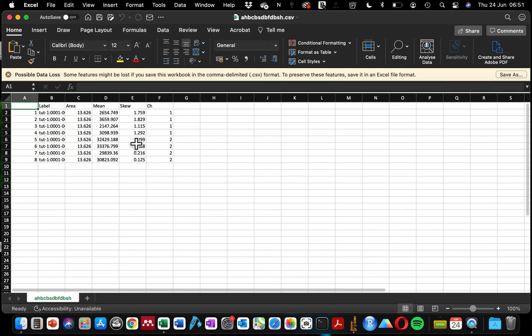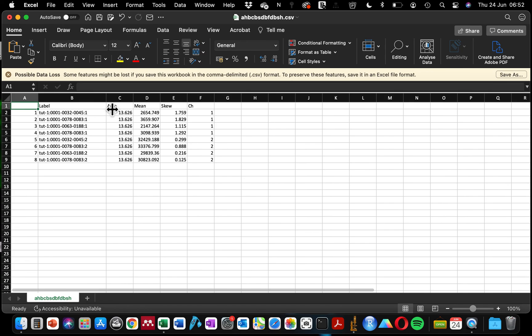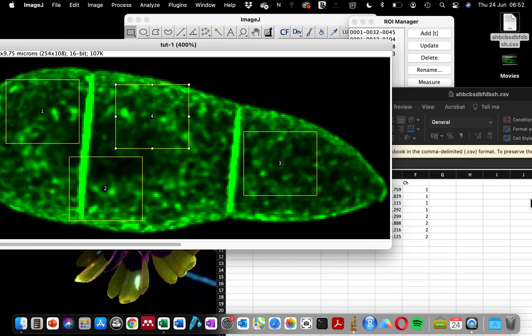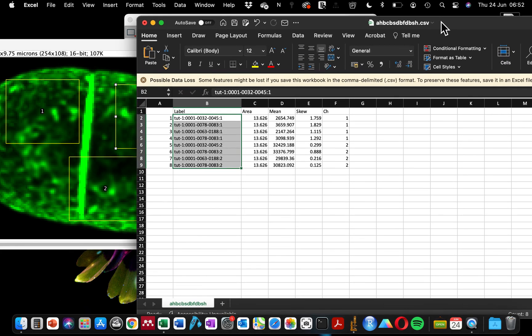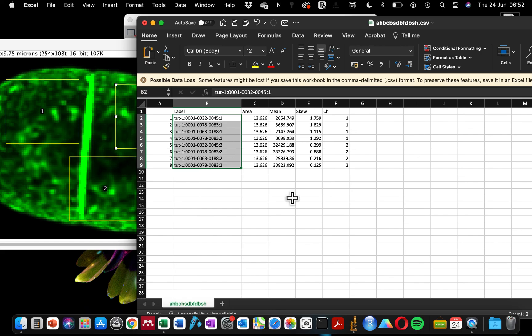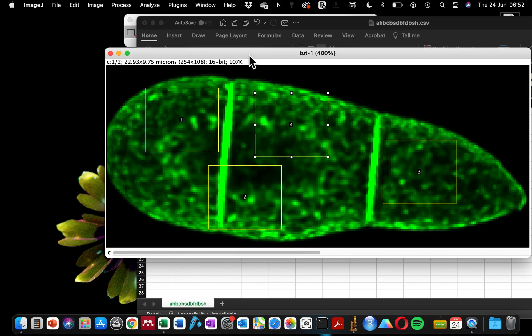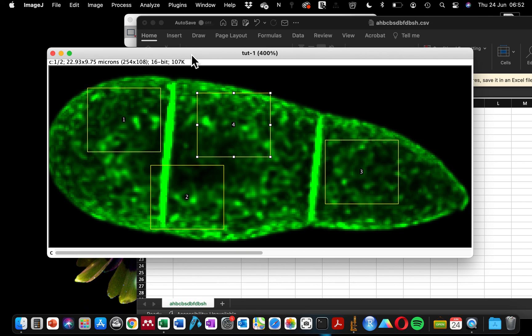If you have several images — let's say you're measuring for 20 samples — the sample we just measured is labeled as '2-1', which is the label name. If your second sample has the label '2-2', it will appear separately, so you won't mix up the analysis. The reason we are getting measurements for both channel 1 and channel 2 is because our image has two channels: the brightfield and the fluorescence field. I hope you found today's tutorial very useful. Please write in the comment section — these lovely comments encourage me to record the next tutorial. Until next time, have a lovely day.